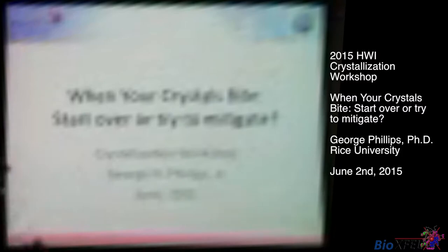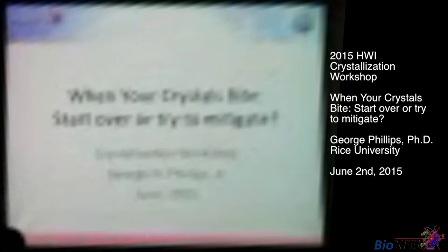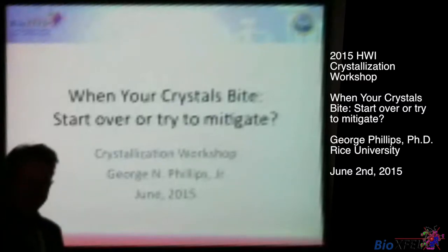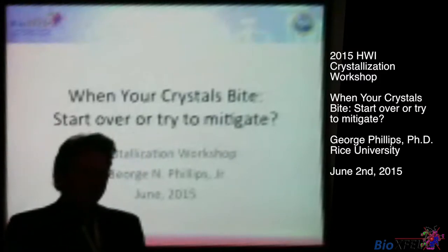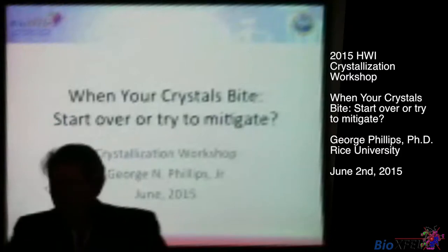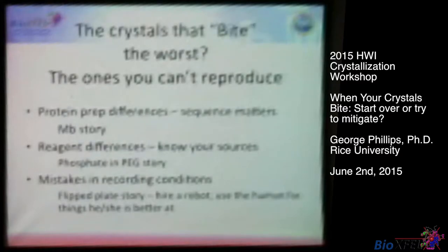One of the jokes I have in my lab is that if you create a crystal that's twinned, you should throw it on the ground and step on it and bleach it and make sure that it doesn't nucleate anything else, right? But there are ways now to deal with certain crystal pathologies. Sometimes you don't have a lot of choice. You have to suffer through some of the problems that your crystals have, and I'll show you some examples of those and editorialize a bit on what works and what doesn't work.